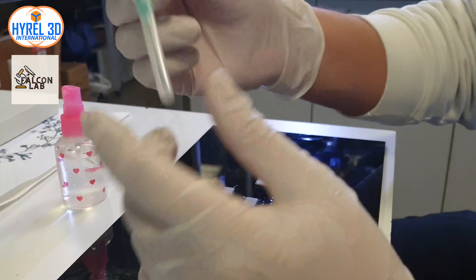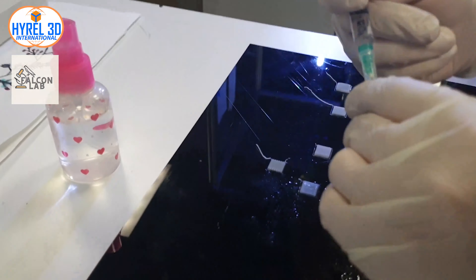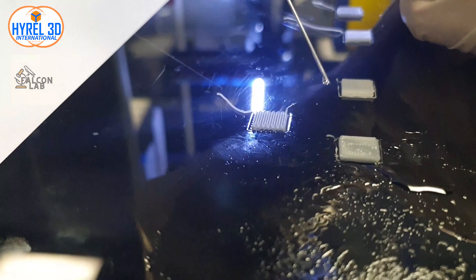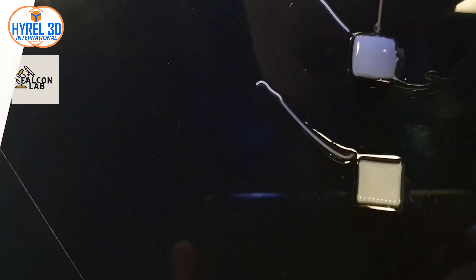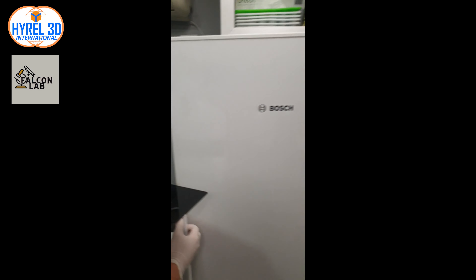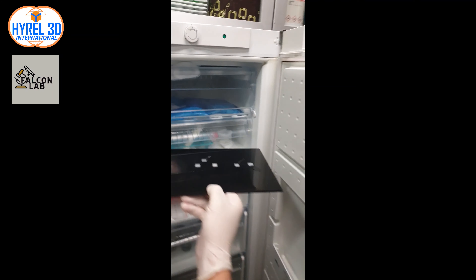You can add the ethanol-water solution to a spray bottle or apply it as drops. Let's add some drops to our printed scaffold. Now we will take the print bed and place it in the freezer.